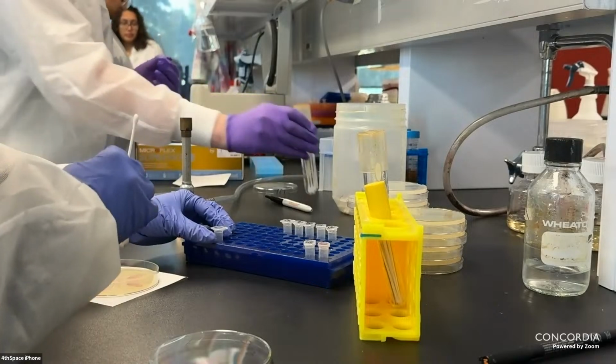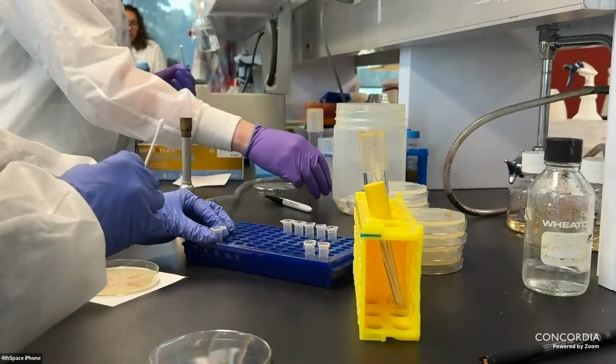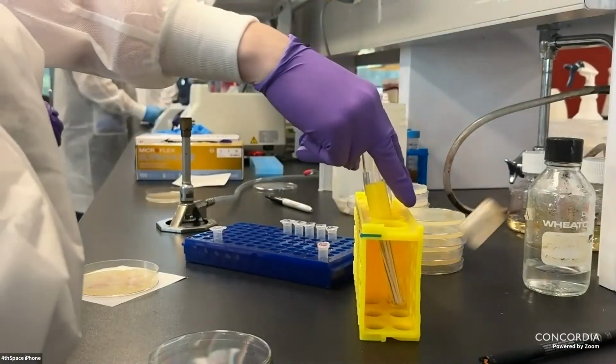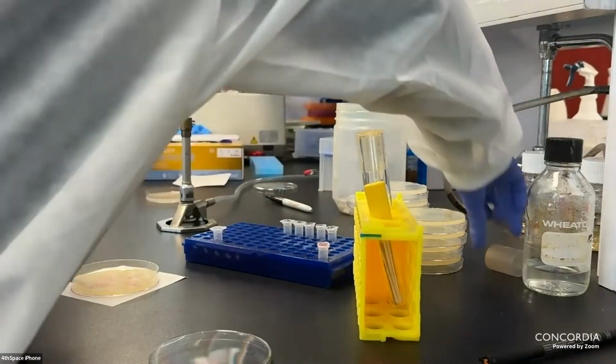That's green. So GFP stands for green fluorescent protein. Yeah, and then the red one is sometimes called RFP. Oh, I'm sorry, I wrote GFP on it. Oh, that's okay.